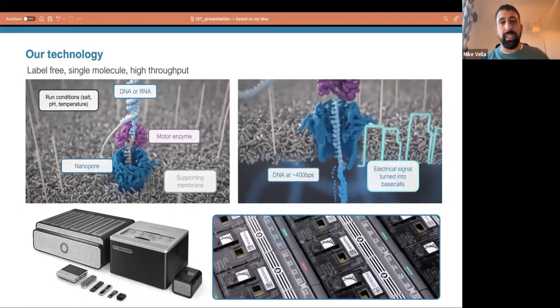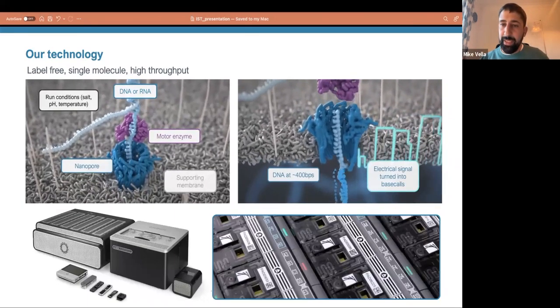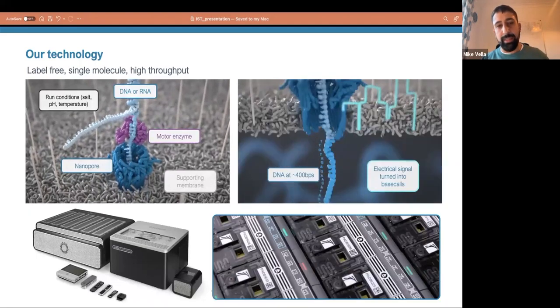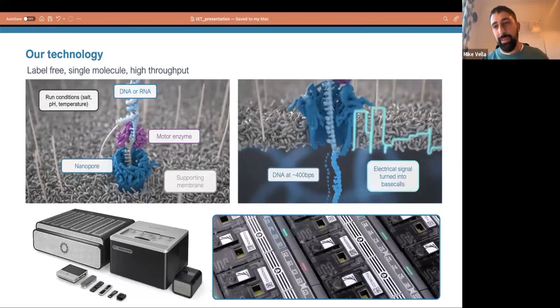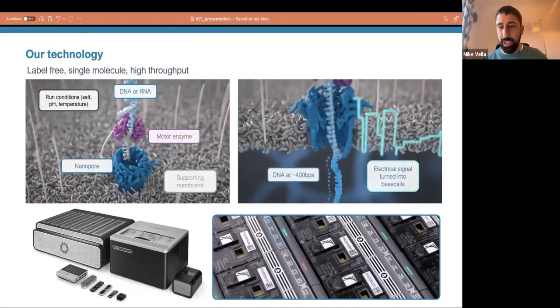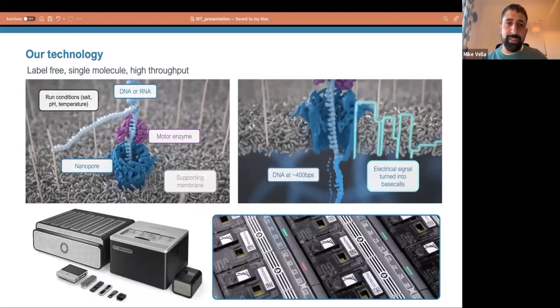Other DNA sequencing technologies use variants of a method called sequencing by synthesis. This exploits the fact that DNA can be replicated via a molecule called DNA polymerase. It's the fundamental way that genetic information replicates and is inherited.